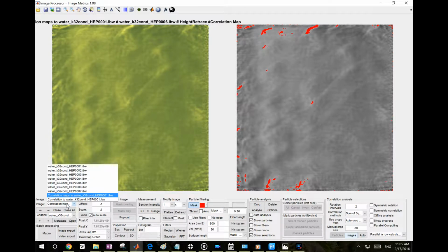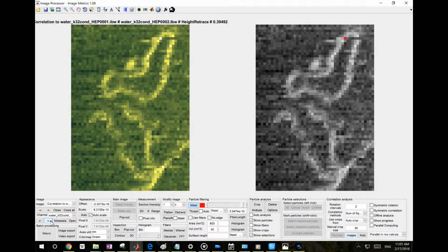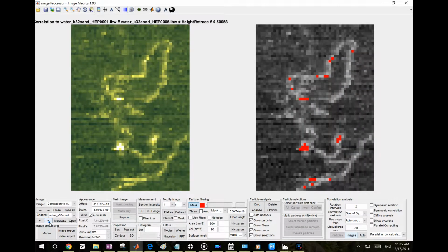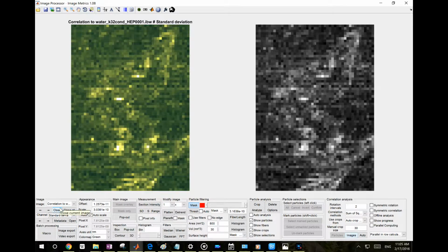To verify that the match is perfect, you can go to the correlation and then check individual images. The first one is the template, and then we go through this. So this one apparently identifies that these are the same spot in different images, but they have moved in space, but the software identifies them and extracts them. And in the end, all these images, because they're similar, they're matches, right? They will be averaged.